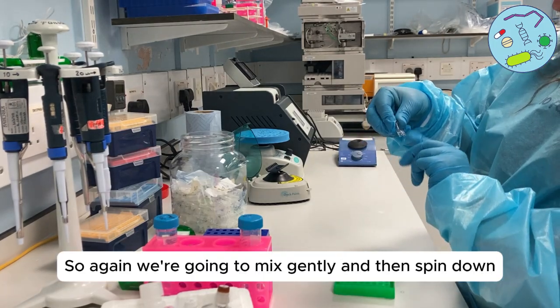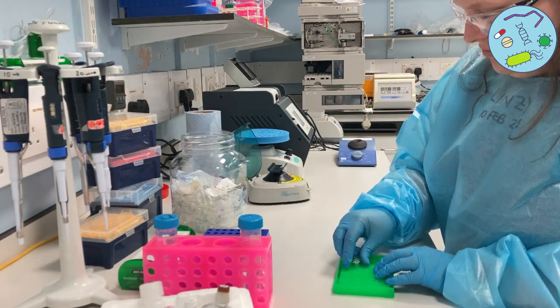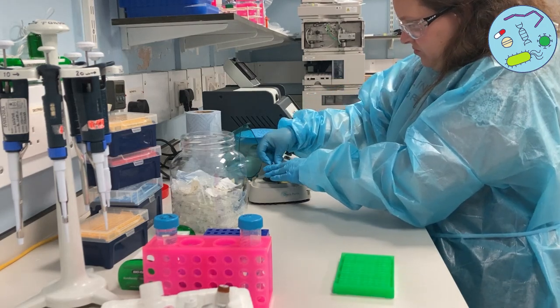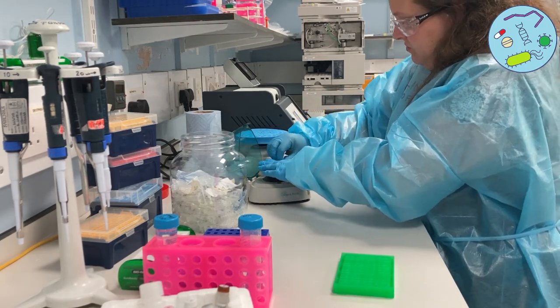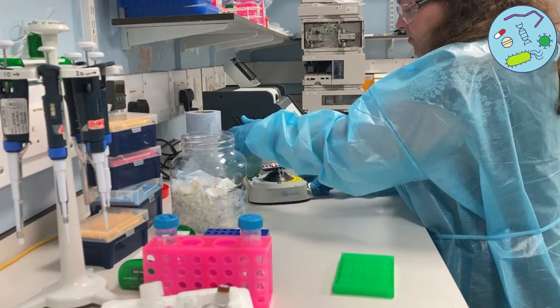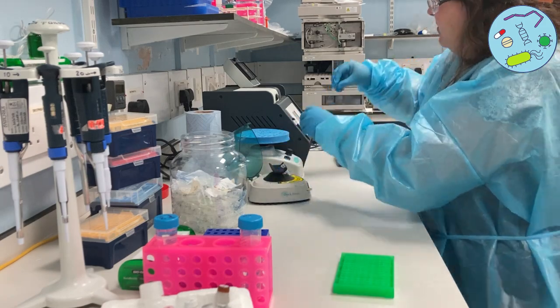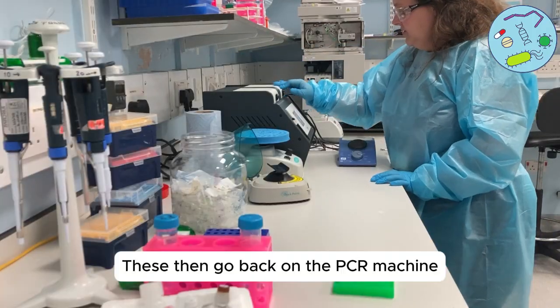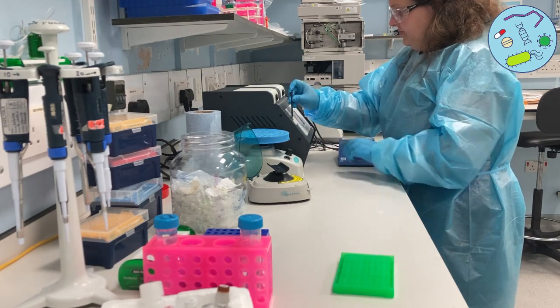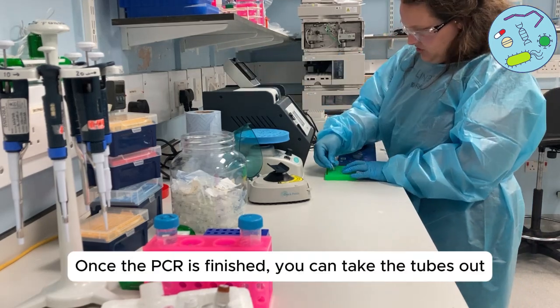We're going to mix gently and then spin down. Then run the PCR machine using the conditions mentioned in the protocol. Once the PCR is finished, you can take the tubes out.